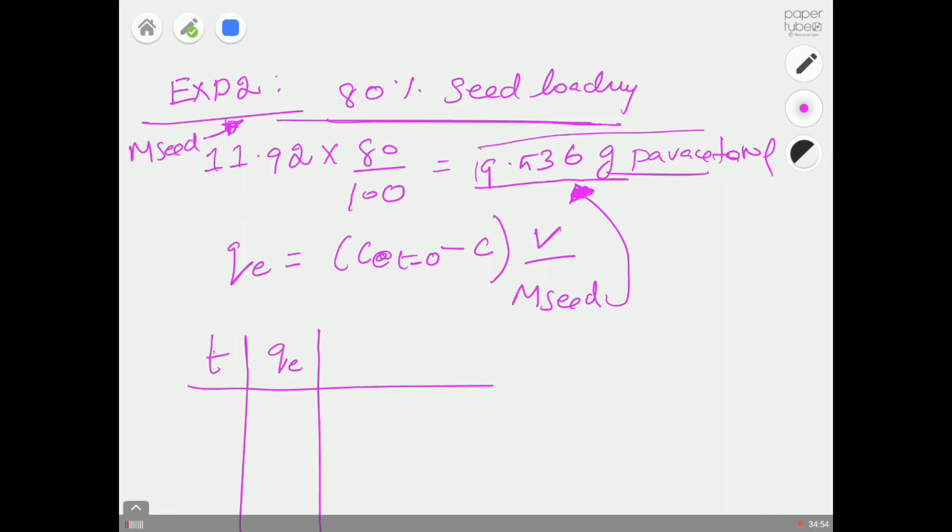And then we monitored the concentration using FTIR, and then we kept an eye on the overall particle counts, and also the particle counts under three different size fractions, using FBRM. And from time to time we checked the shape of the crystals using PVM. So that's how you have to write about the experimental part, and I think that's more than enough. So this is for your lab report.